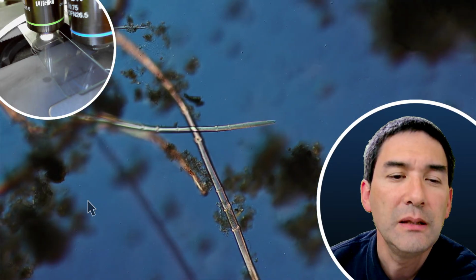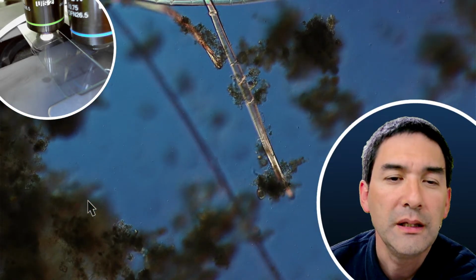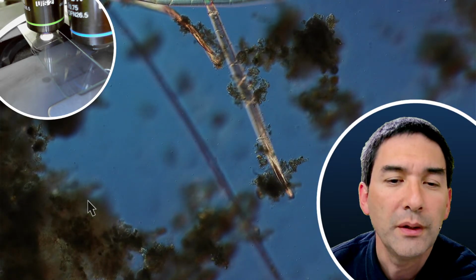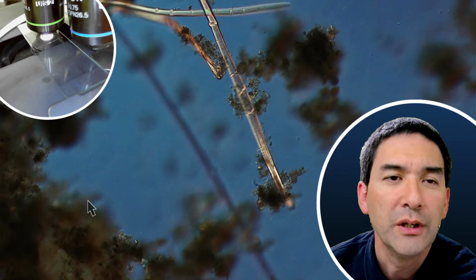This could indeed be some animal fur or animal hair. As a matter of fact, this morning I found the same one, and occasionally you do see some dots swimming around here.